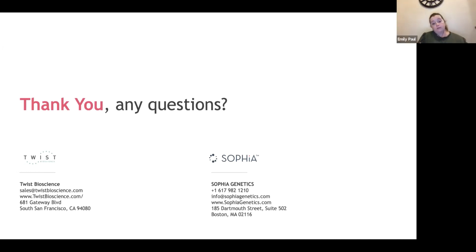So 24 is actually, in fact, much better. We say a minimum of 8, but if we look to a larger set of data, we have a better understanding of consistent coverage profiles, and we can look to them to see which are the best 8 to apply for this modeling. So we have flexibility in the normalization to be able to get the most correct baseline.